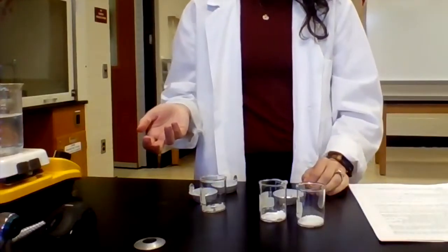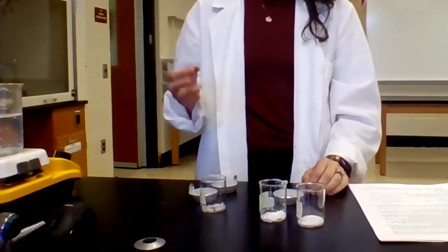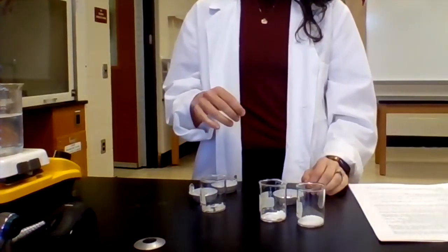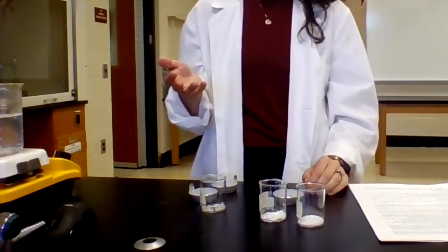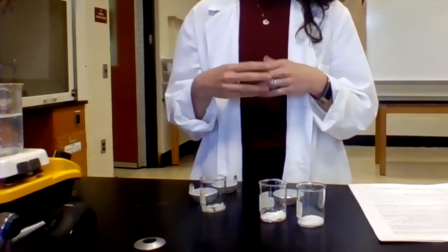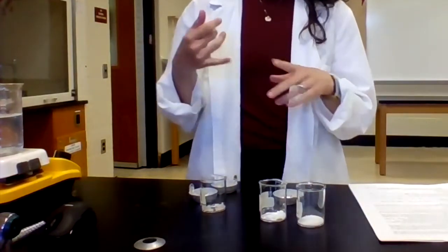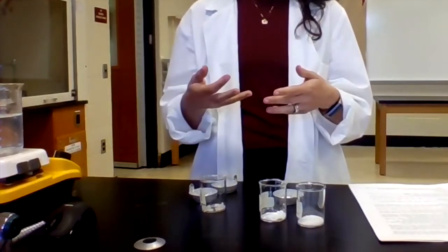So the next property that I'm going to test is the melting point. I know that non-polar covalent compounds should have low melting points because they have weak intermolecular forces, so it doesn't take a lot of heat to overcome them. Whereas polar covalent and ionic compounds tend to have much higher melting points.